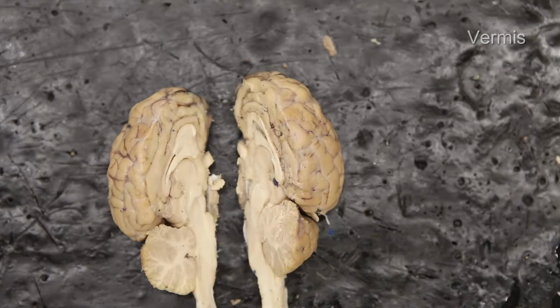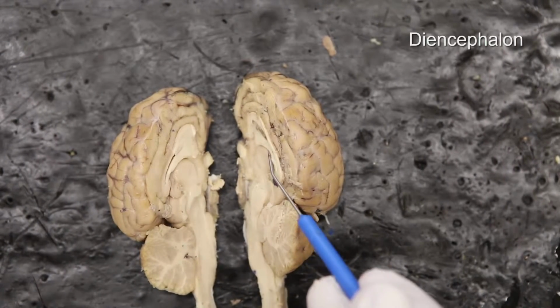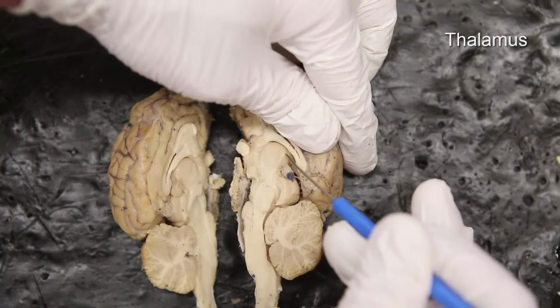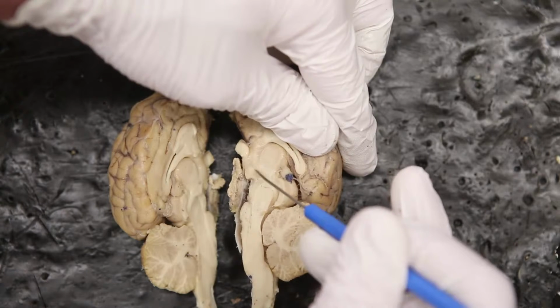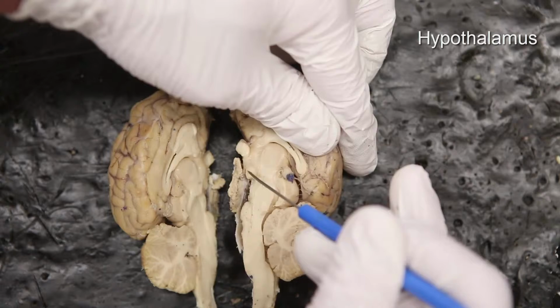Now going into the central part of the brain. The central part we have right here is known as the Diencephalon, and you're going to be able to see the thalamus. This circular structure right here is the thalamus. Going just down here, this is the hypothalamus.